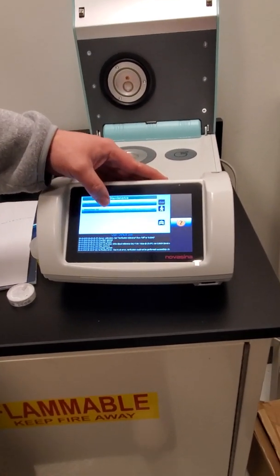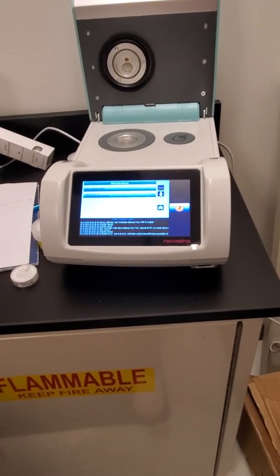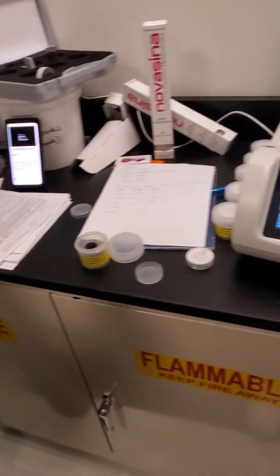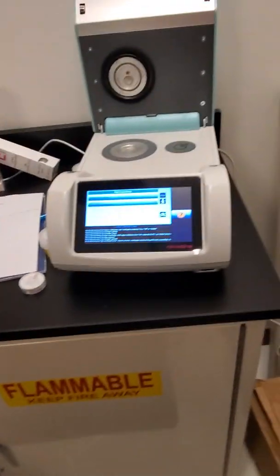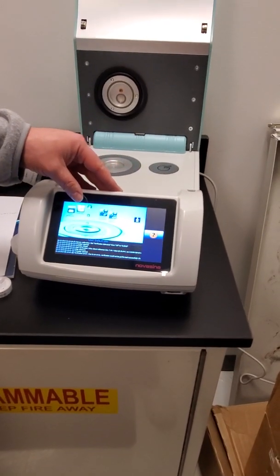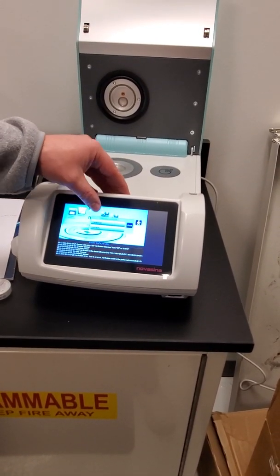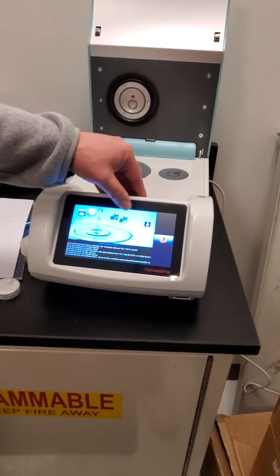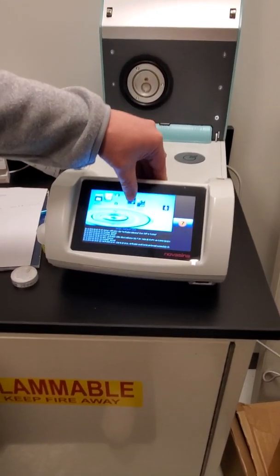And then if you want to connect it to a computer, it will tell you how to do that in the instructions because you do have to tell it how you're going to hook up to it, so that it puts the data out in the right format. And this is just display. You can do a normal or with the graph. There's your print protocol if you want to hook it up to a printer.